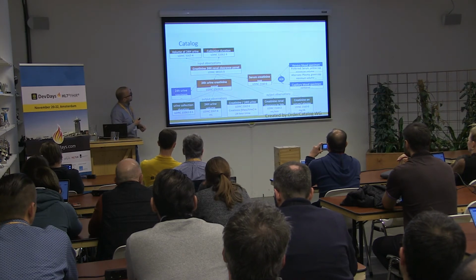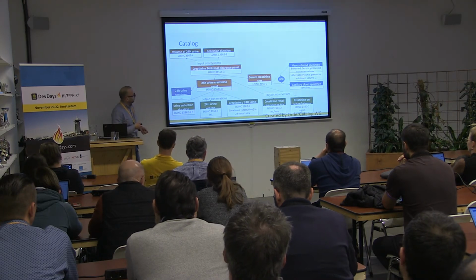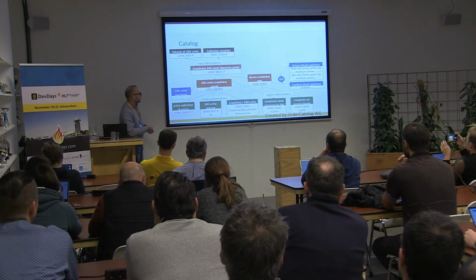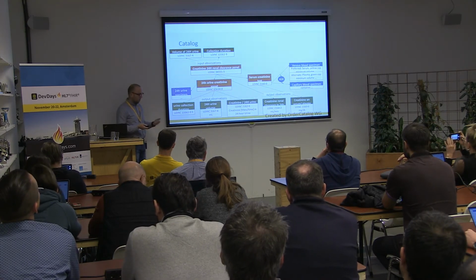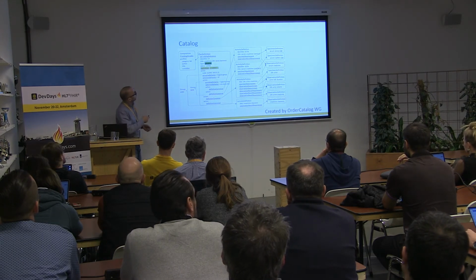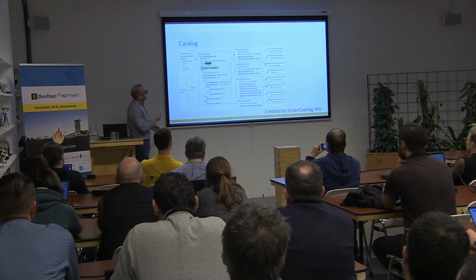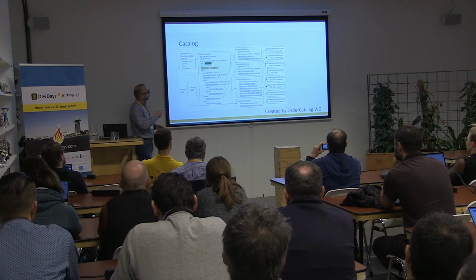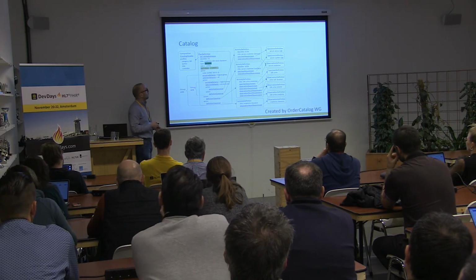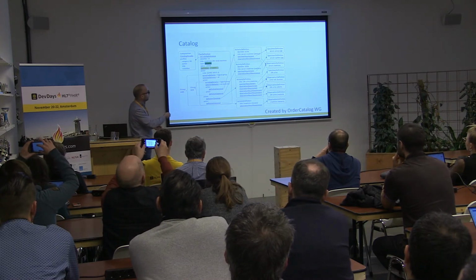and there are some requirements which have to be gathered at order time, and also we would like to write down somehow that a lot of observations will be reported back to the customers. So the main idea is to use the PlanDefinition as a complex resource with actions inside it, and all the actions covered by a logical group. In this logical group, we say that all actions inside it should be done.